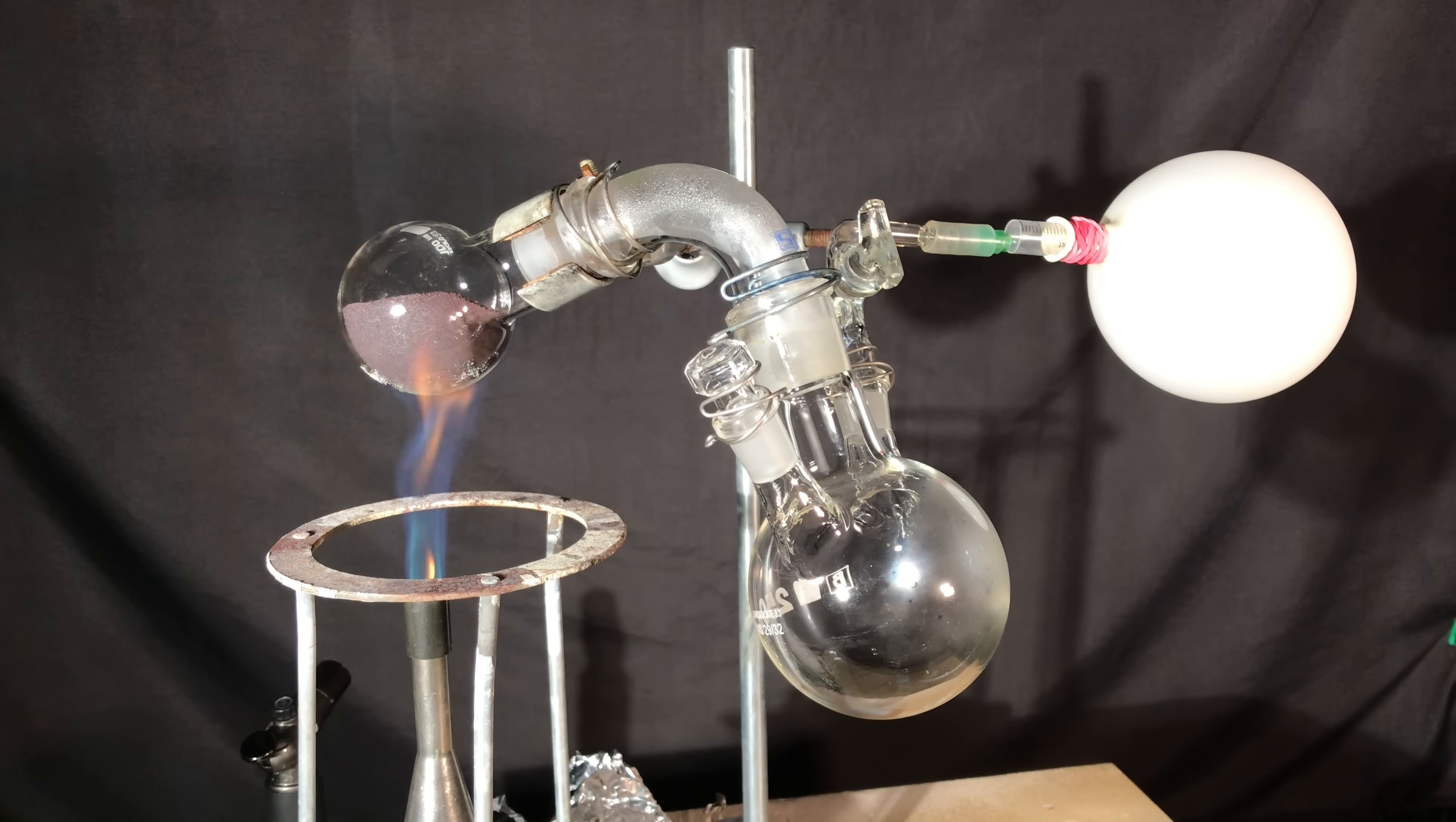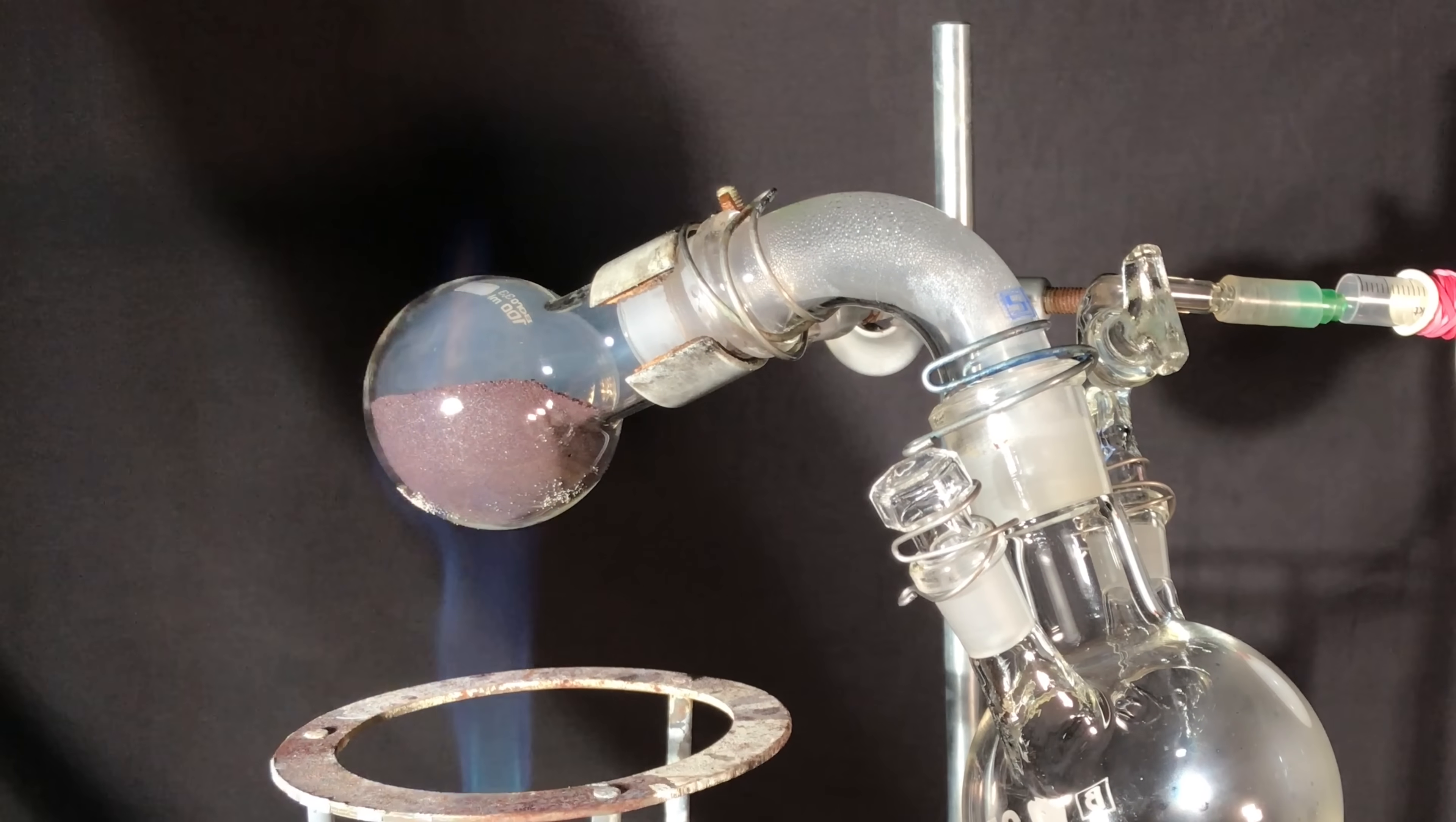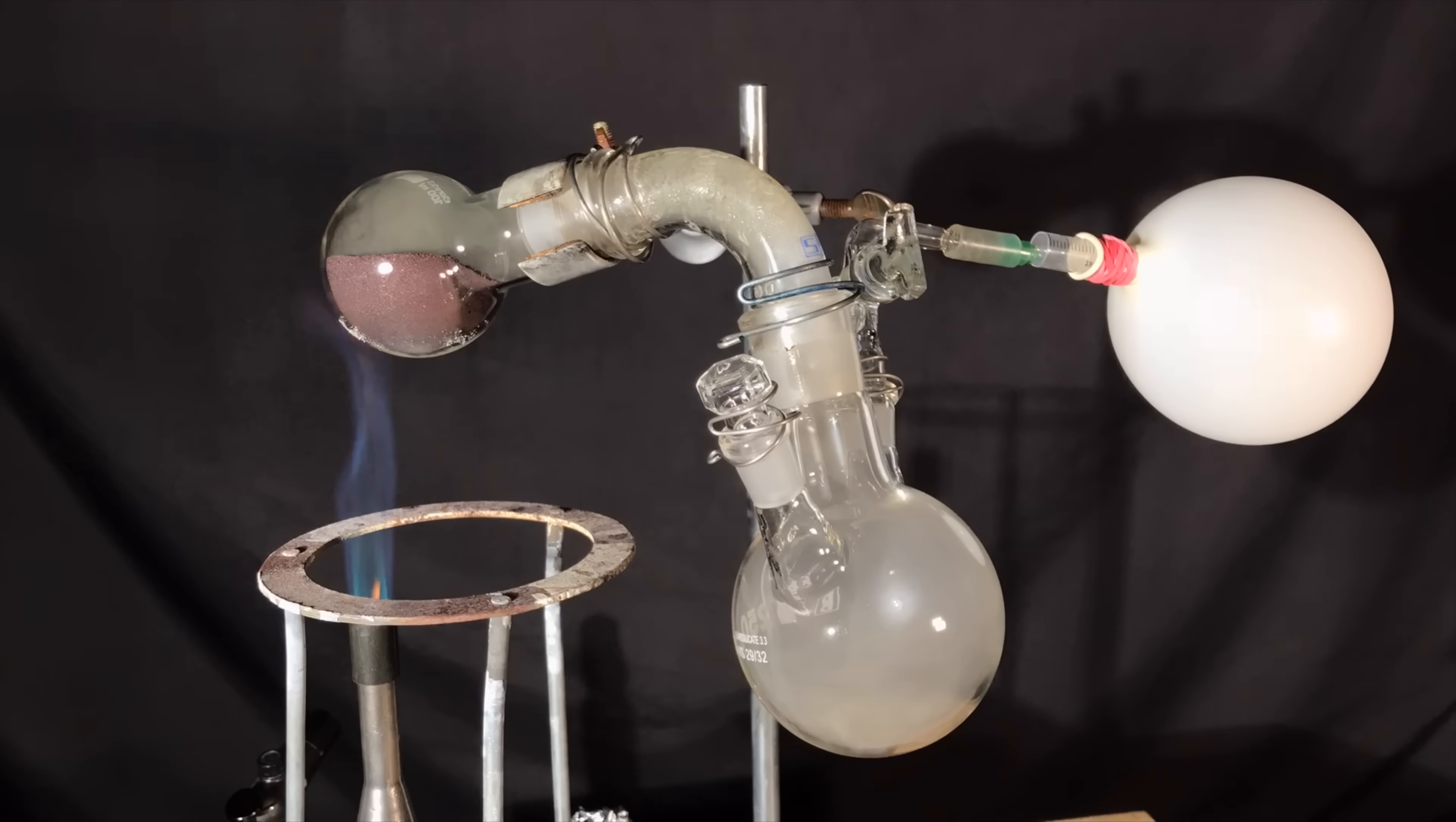The sand bath didn't get hot enough for white phosphorus to start forming. Therefore, the round bottom flask was exposed directly to the flame of the Bunsen burner. It did not take long until you were able to see the first vapors of highly toxic white phosphorus.